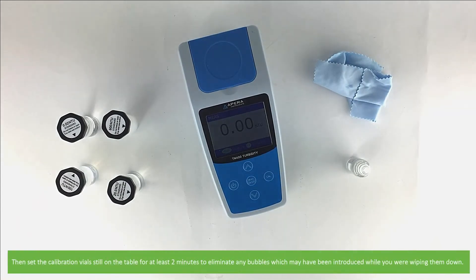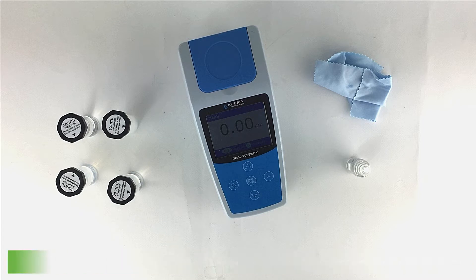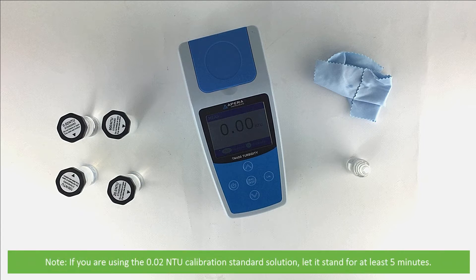Then set the calibration vials still on the table for at least 2 minutes to eliminate any bubbles which may have been introduced while you are wiping them. If you are using 0.02 NTU calibration standard solution, let it stand for at least 5 minutes.